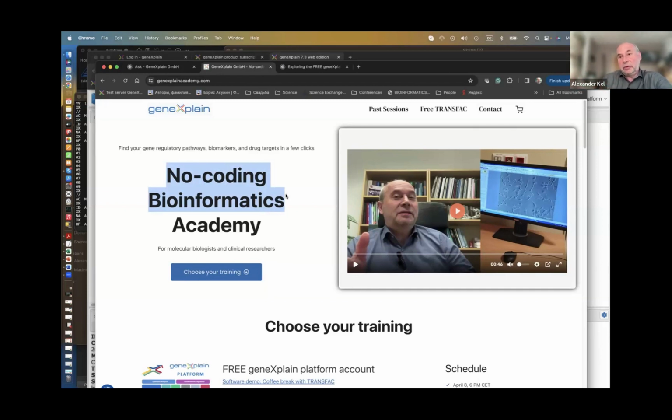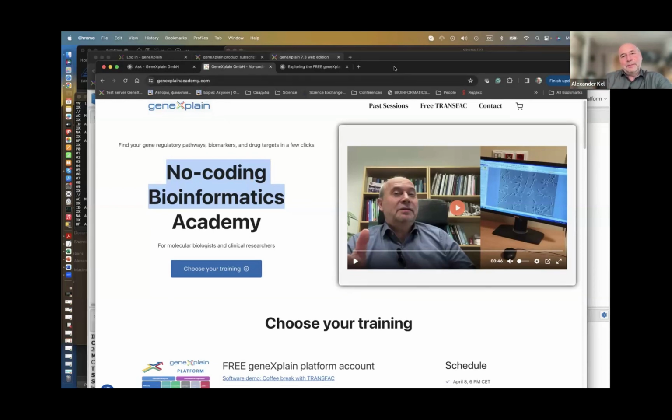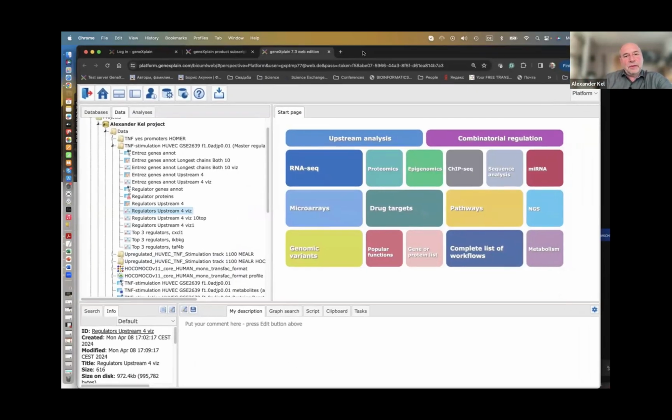So here you can really do it by drag and drop, by clicking, and save time on routine things like writing programs. Somebody will do it for you. Spare time for your real research. So that's our motto.